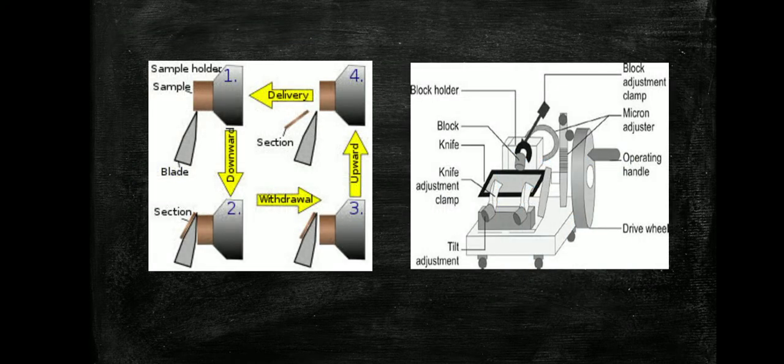This is the schematic diagram of the processing of a microtome.